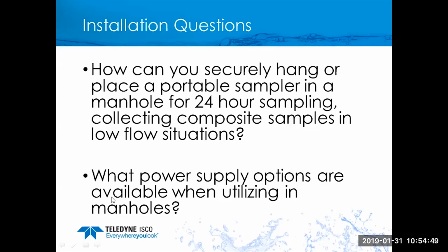Lead-acid batteries do have a somewhat higher capacity. They are also a better choice for what we call standby power, where the sampler is in a location, waiting for the sampling conditions to exist at some unforeseen time. When that condition arises, we want to ensure that our power source has enough energy to be able to power the sampler for that duration.